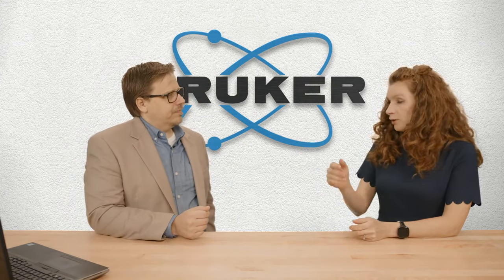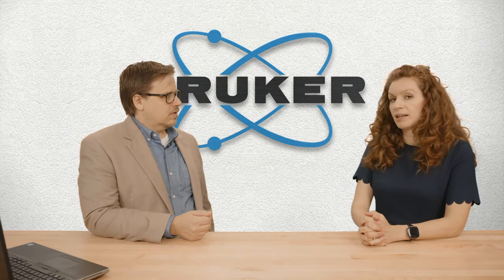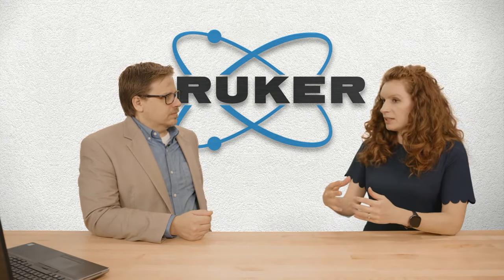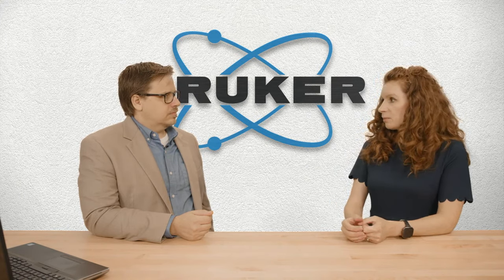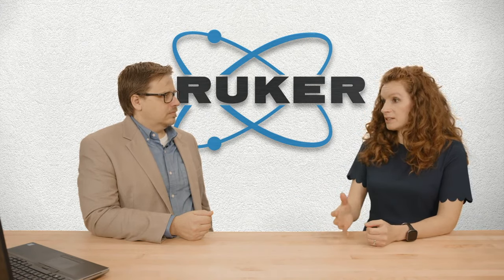On the other hand, WDXRF, as I said, gives you better resolution. It also can measure lighter elements. So if you need to measure fluorine or nitrogen or the carbon that you mentioned, you can only do that with the larger floor standing models. And then the other thing is speed, right? So EDXRF, yes, to get to certain margins and to get to certain repeatabilities, you could measure longer. But with the larger floor standing WDXRFs, we can, for example, measure the 10 elements that are needed for cement analysis in less than 5 minutes.